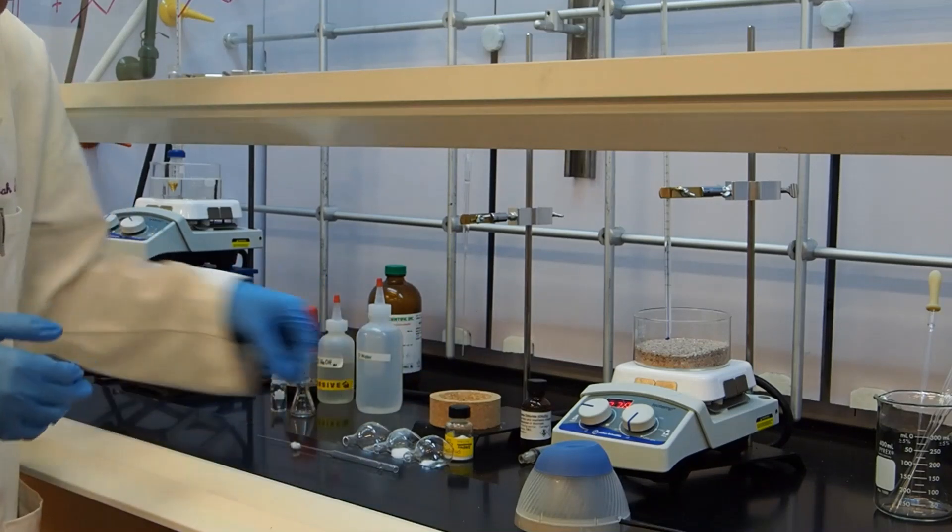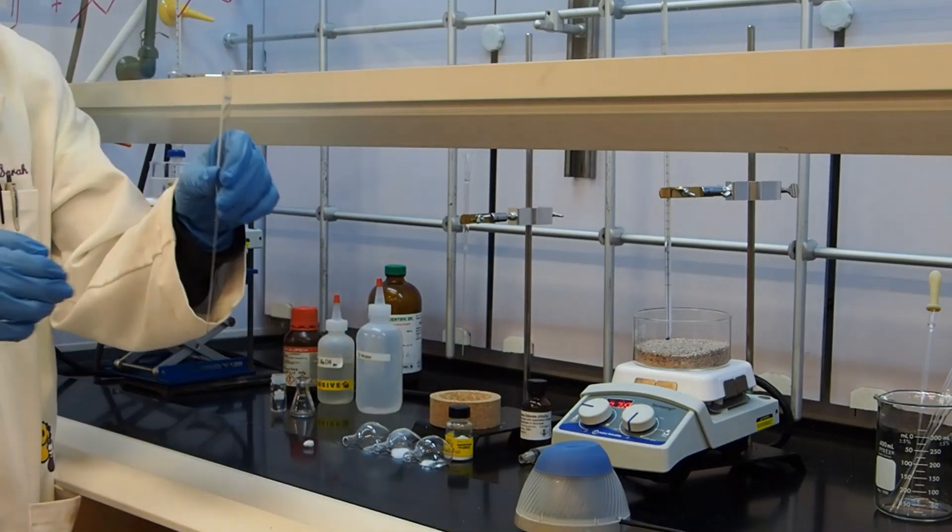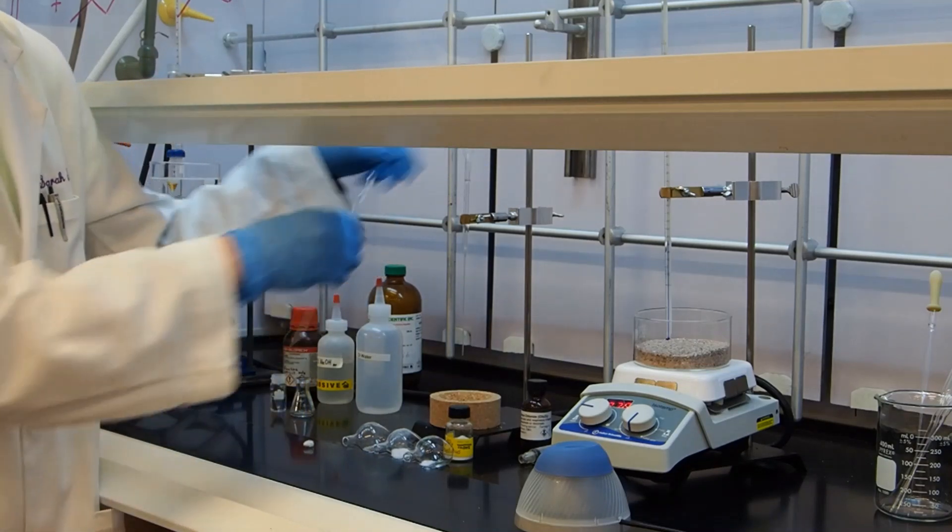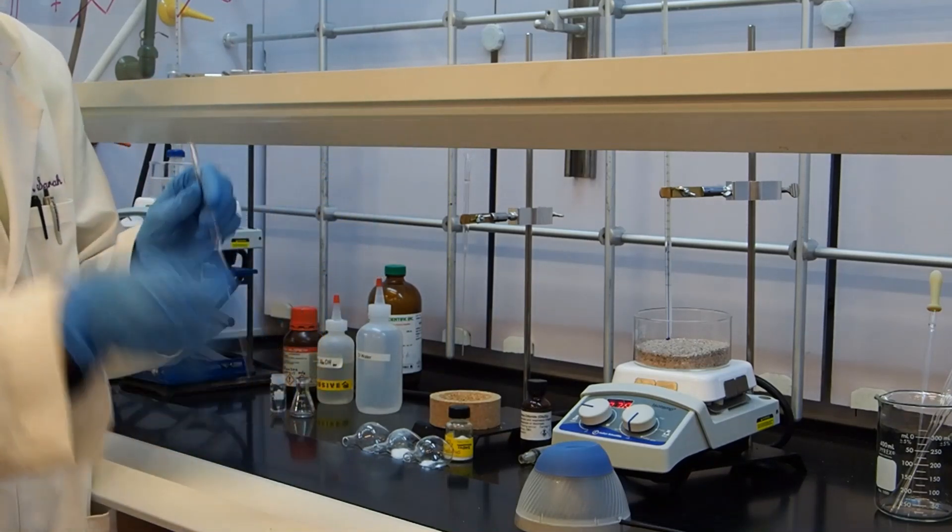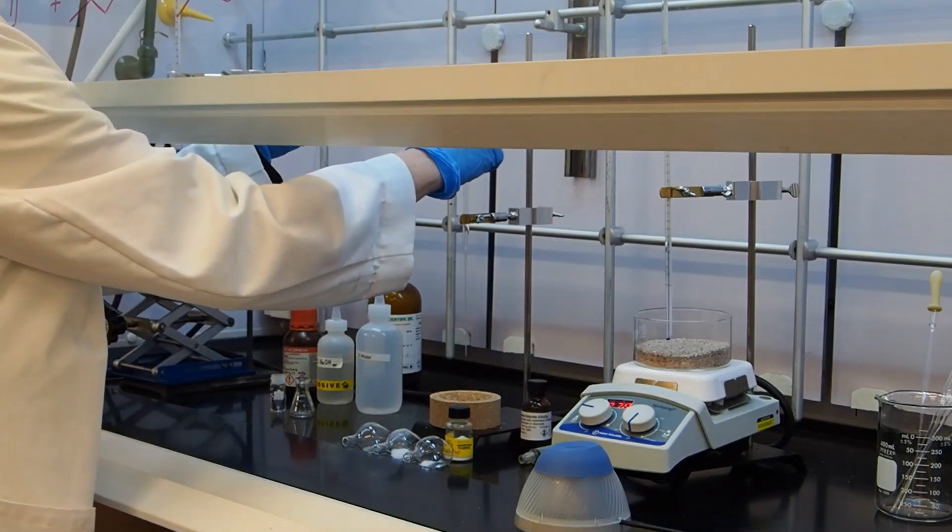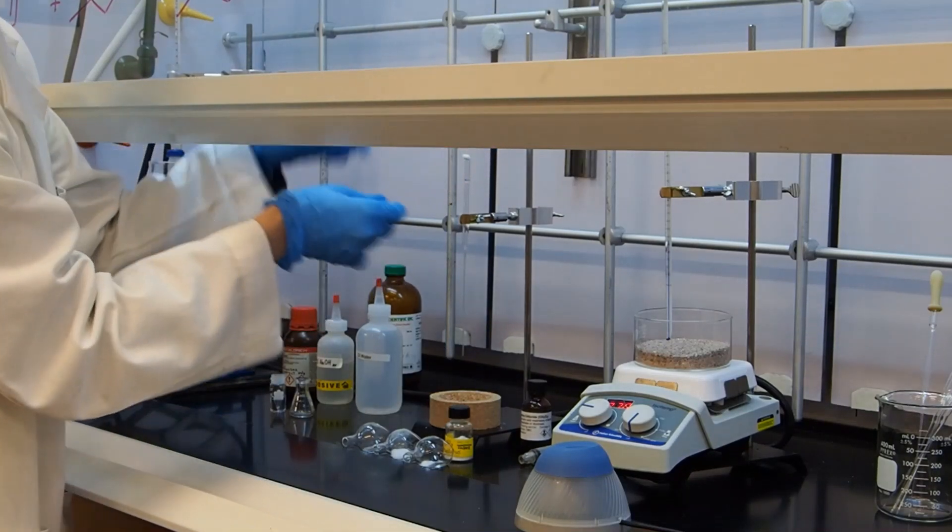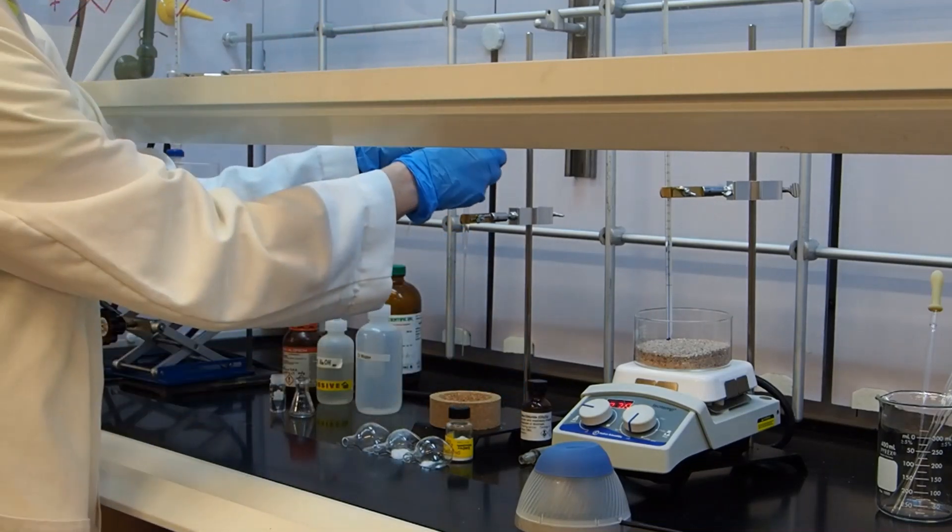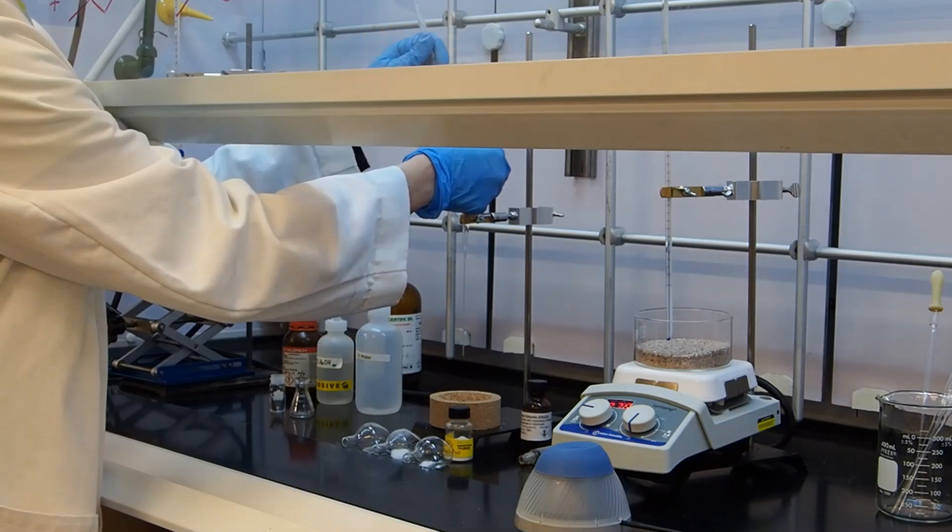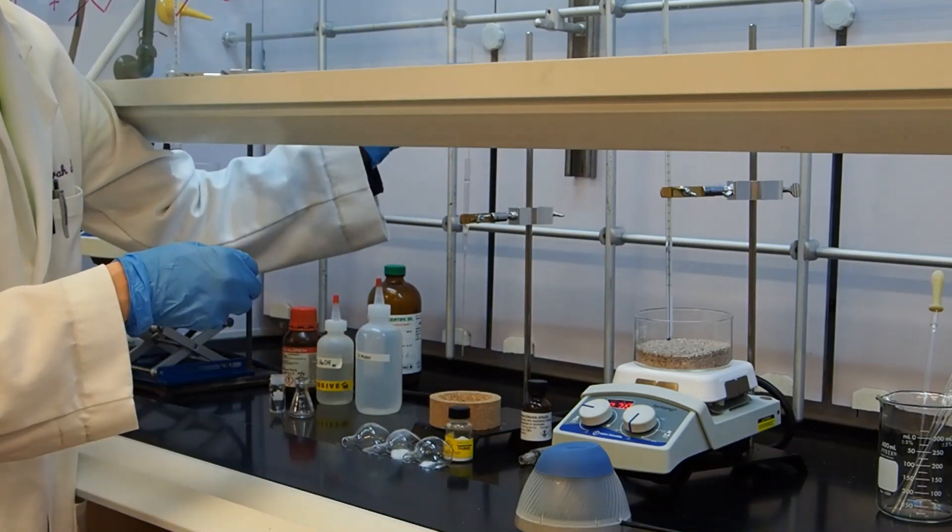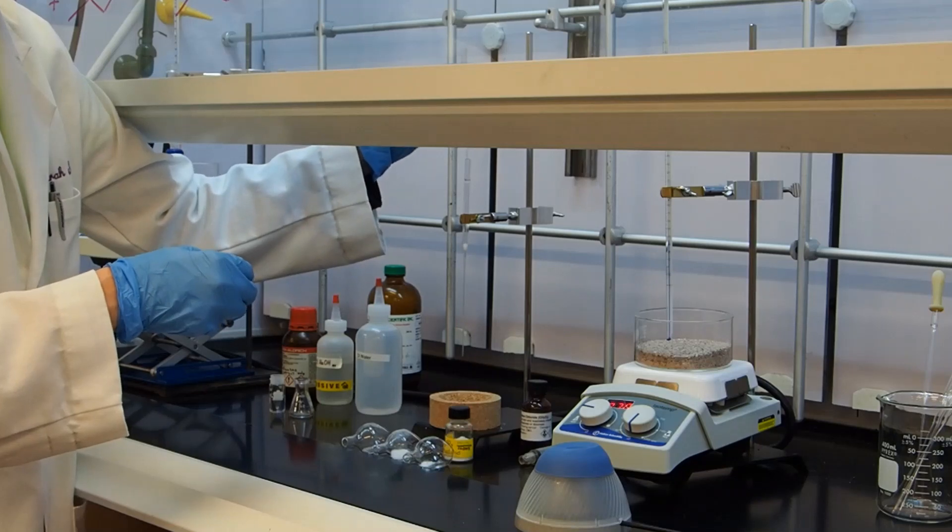This is going to be my micro scale chromatography column. I have a tiny piece of cotton. I'm going to use this pipette to place the cotton into the column and gently stuff it down in there. I'm going to be very gentle. You don't want to jam it in there too tightly.